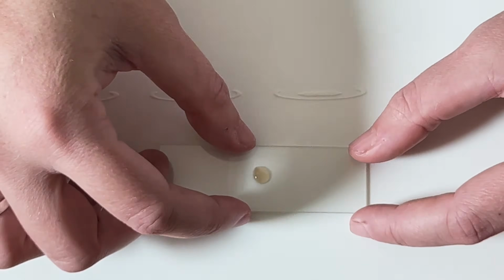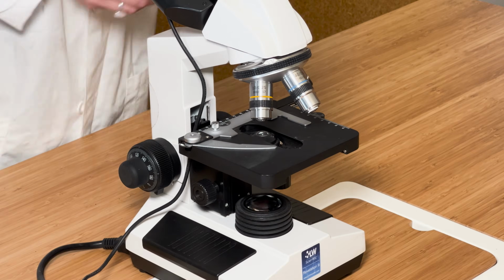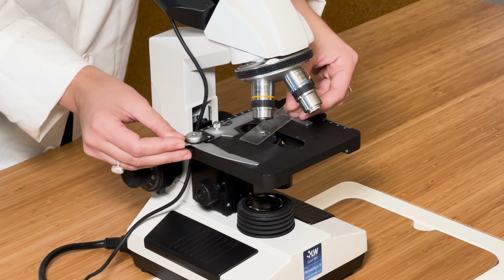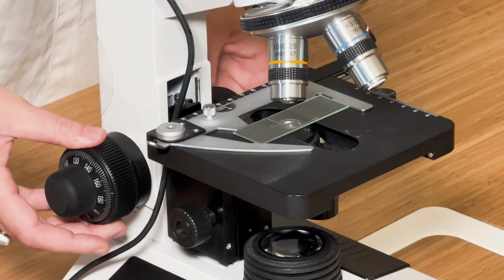Cover your sample slowly with a cover slip, keeping it from spilling out over the cover slip's edges as much as possible. Use one hand to open the slide holder on the microscope stage, and the other to put your slide into place for viewing. Now you're ready to get started looking at your sample through the microscope.